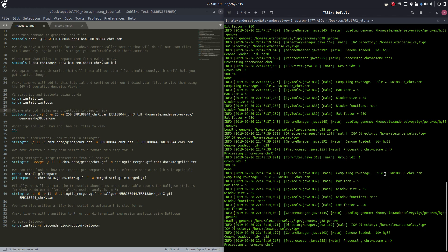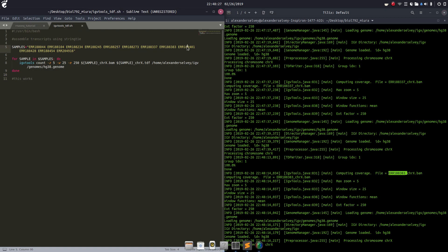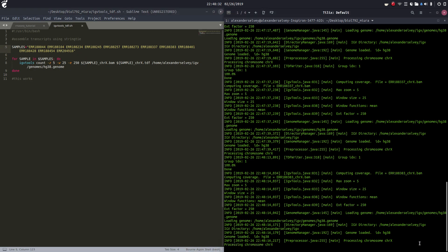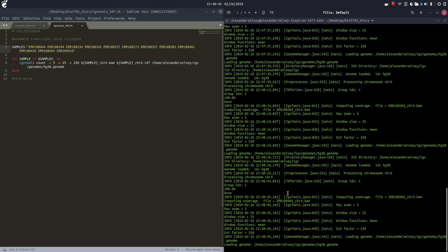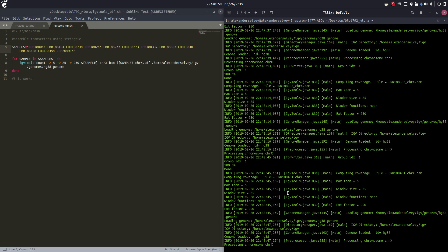We're at ERR188383 now. One, two, three, four more to go after this — it's been running for a couple minutes and going considerably quickly. There's no option to increase the threads, but it's running fast. We'll be opening IGV from the command line and opening all of these files at the same time. It's pretty simple: you just hold Ctrl and click all the files you want to load, hit load, and you've got all your files loaded and can see all the alignments.